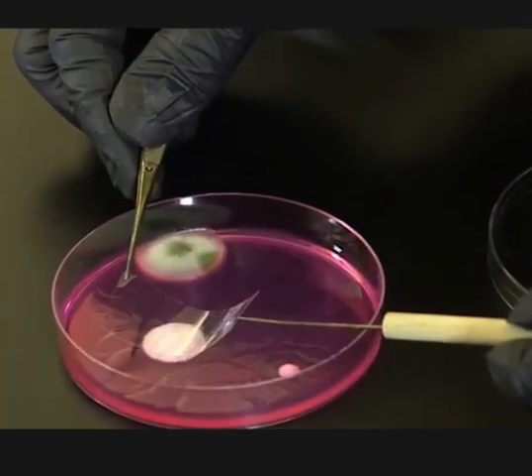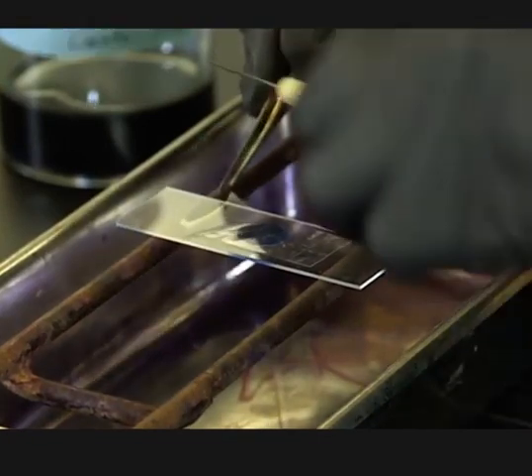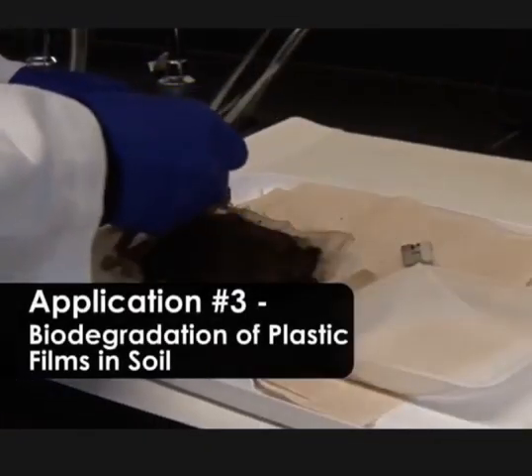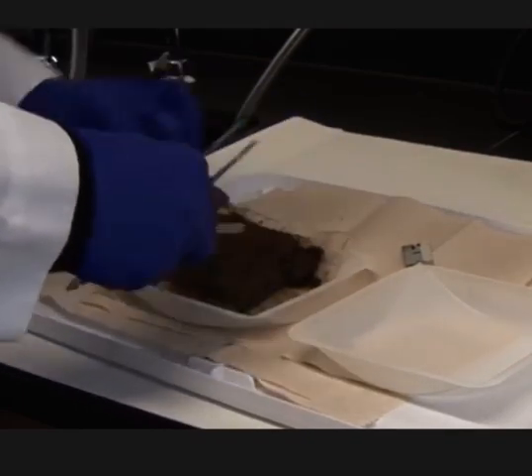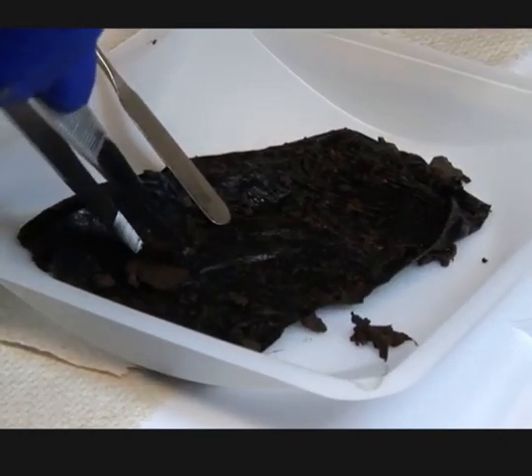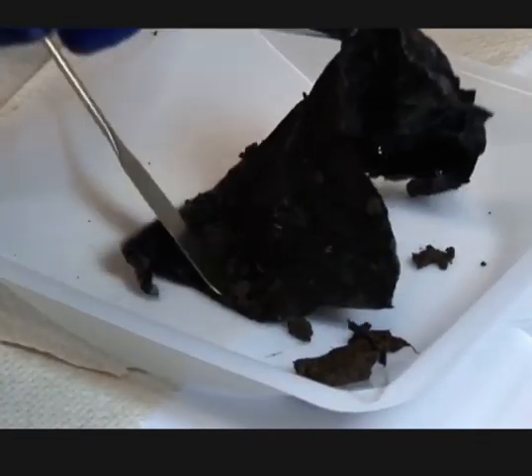Fungal colonies were counted and mounted to a glass slide using adhesive tape. The fungi were then imaged using a light microscope. Soil microorganisms naturally break down components in soil, such as dead plants and organisms. Biodegradation and colonization of biodegradable plastic films was examined, as shown in this example.